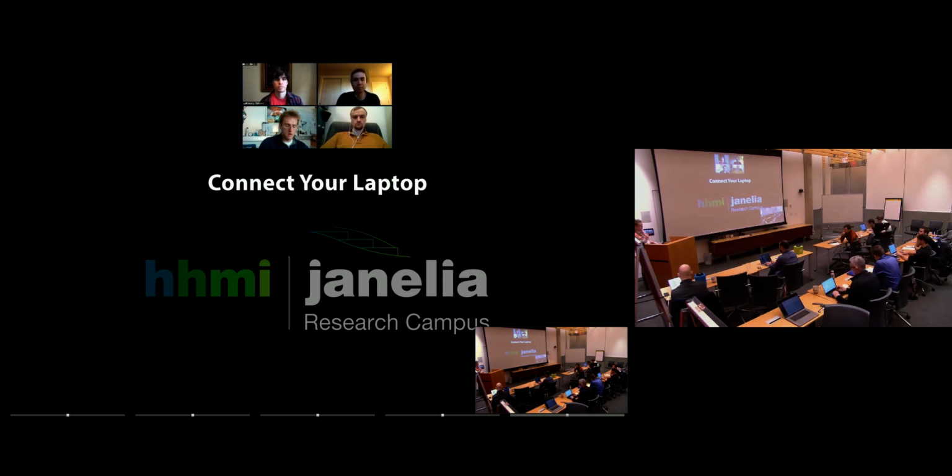That is a framework to do different kinds of data acquisition, primarily around electrophysiology, but it works reasonably well for microscopy as well, and it's an easy place to put stuff if you're coordinating a bunch of different activities across different devices.